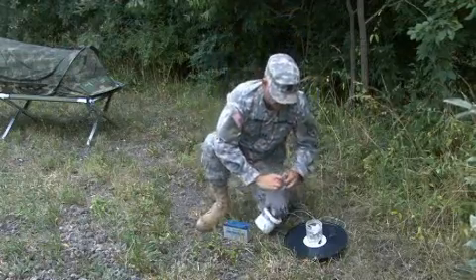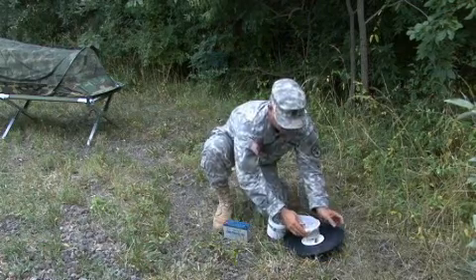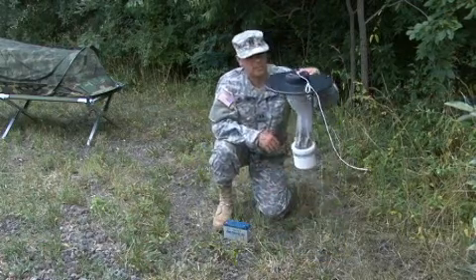Attach the collection container or net bag to the body of the trap. Your collection bag may look different from the one in this video.